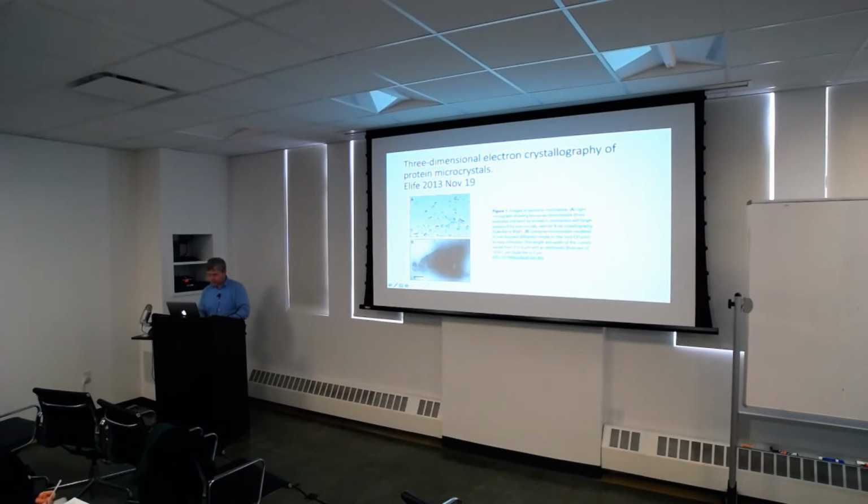This is a sort of real space image in the microscope. So this is probably done on a quantifoil grid. I think this is a 2-micron hole here, and then this is the crystal itself. The scale bar is 1 micron. So this is sort of what you're imaging. You would set up your SA aperture to cover this, and this is a flat, wide crystal.